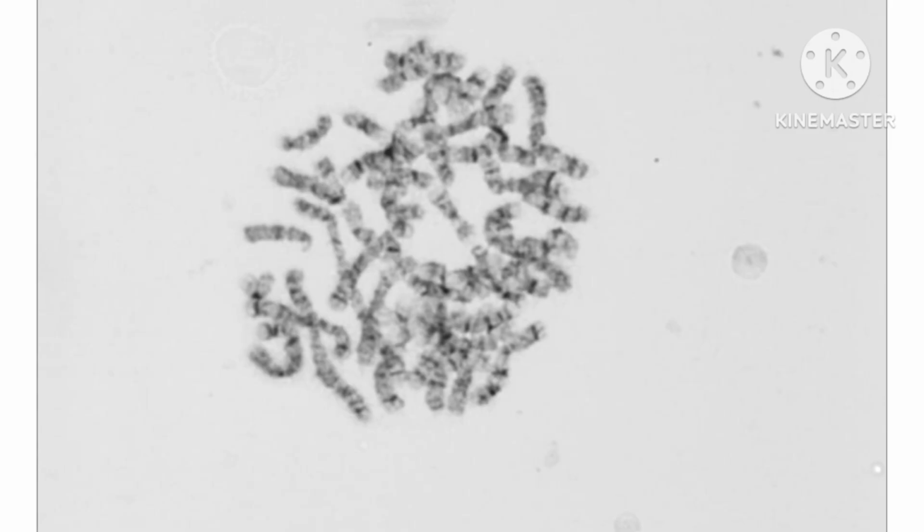This is the image of a well spread metaphase. Here we are seeing how metaphases are well separated from each other. So here we can easily identify the chromosomes, and it is easy to analyze the chromosomes. This is the image of a clumpy metaphase. Here we are seeing chromosomes overlapping each other, so it is very difficult to identify and analyze them also. This metaphase shows there is loss of chromosomes.